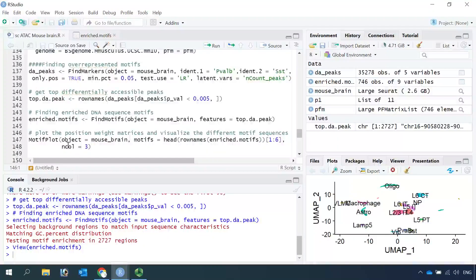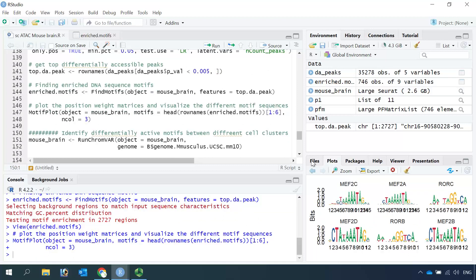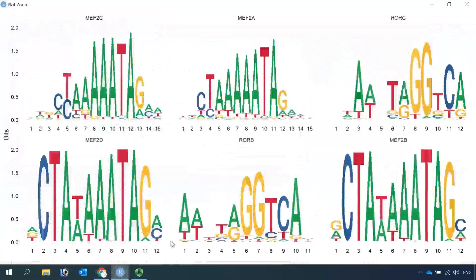So we have the data frame for the enriched motifs. Now we can use the MotifPlot function to visualize the motif sequence. If we zoom in, you can see the position weight matrix for the enriched motifs. This is how to find the highly enriched motifs using differentially accessible peaks.